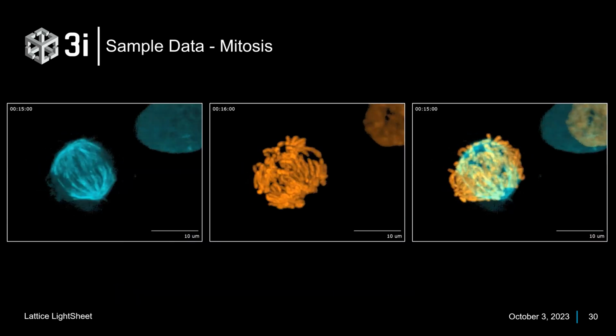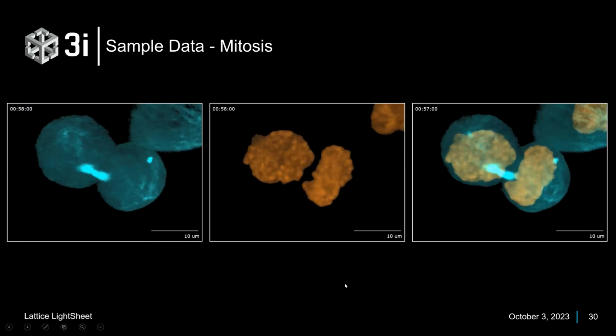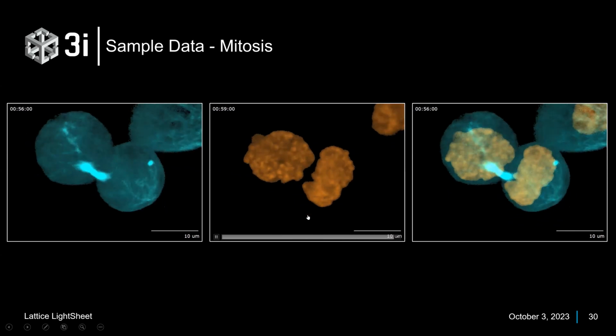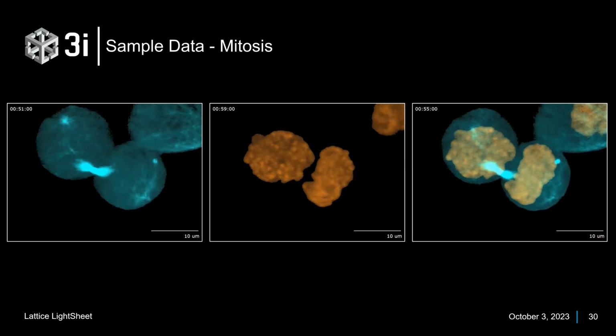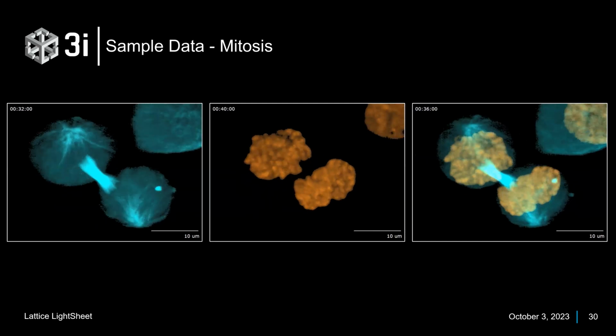This is that mitotic sample I showed before, where now I just have it separated out so you can see the different channels a little bit more easily. This one's great because you really can see individual chromosomes and the different bandings across them. That original Betzig paper has examples of them actually karyotyping cells using this fluorescent data. So it really can give you wonderful spatial resolution over time, nice and gently.